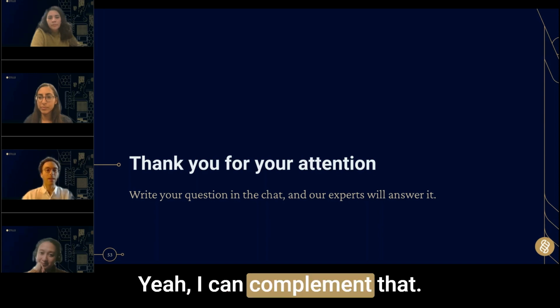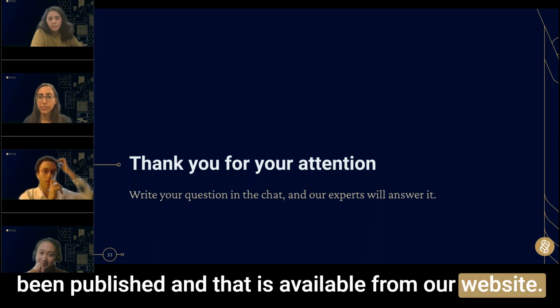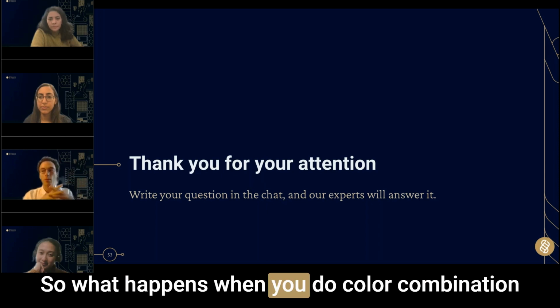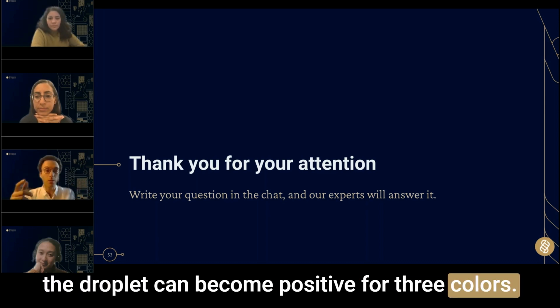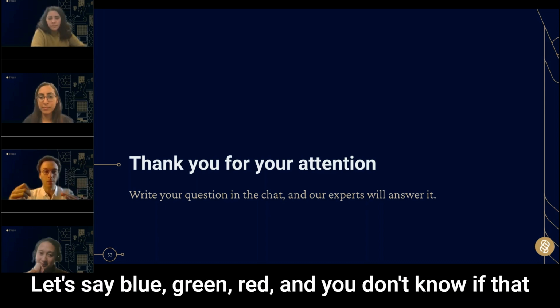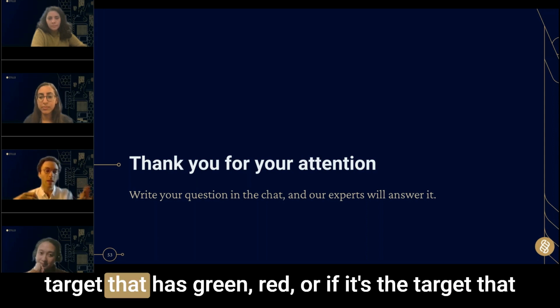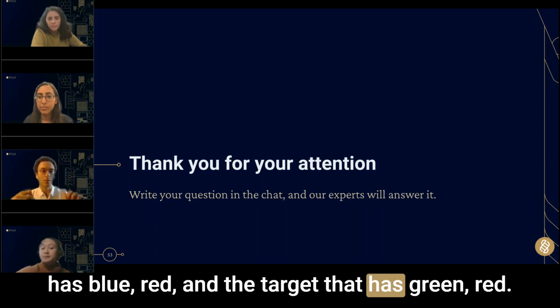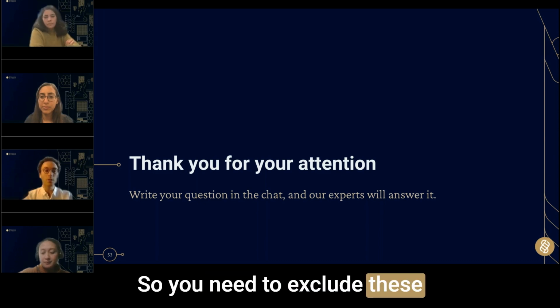Yeah, I can complement that. That is a very good question, and we actually have covered that in a paper that has been published and that is available from our website. So what happens when you do color combination is that if you have co-encapsulation of 2 targets, the droplet can become positive for 3 colors, let's say blue, green, red, and you don't know if that comes from the target that has blue, green and the target that has green, red, or if it's the target that has blue, red and the target that has green, red. So you don't know which targets are present. So you need to exclude these droplets from the analysis.